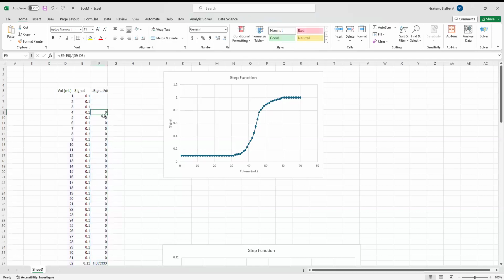Well, you can just take the derivative, which I've done over here. You'll see that the derivative is just the slope, right? So I'm spreading this out by 4 points here, and that's just to try and smooth things out, average things out a little bit. You could do it every one, you could do more.